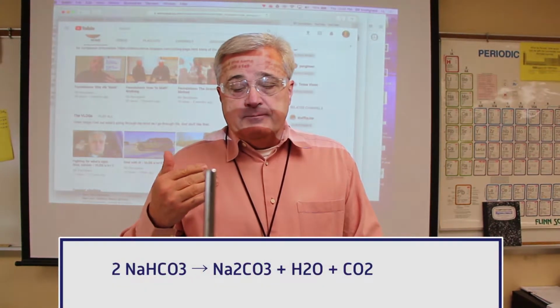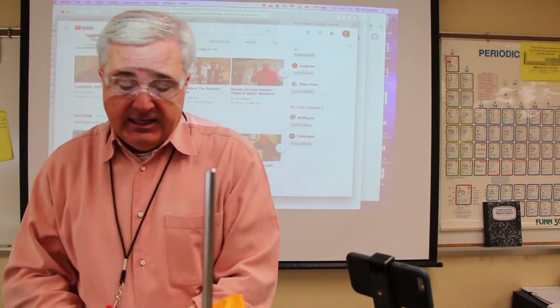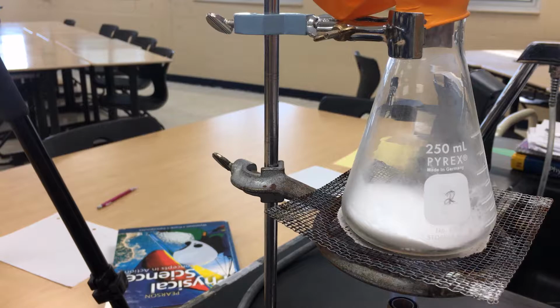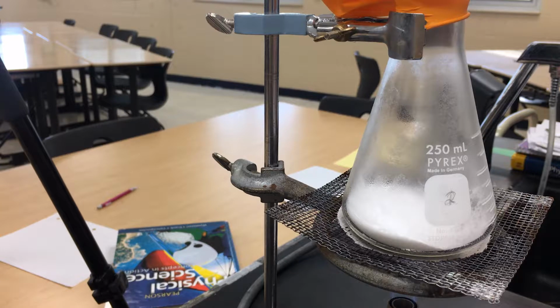So the reaction that I'm going to demonstrate is a sodium bicarbonate thermal decomposition. And so we're going to begin that by adding heat. In the flask, the key here is that to begin with, it was a dry powder and room air in the flask. And immediately upon putting heat, the decomposition begins to take place. Water is one of the products that is formed in the decomposition. And you can see right away that the water is condensing on the inside of the glass.